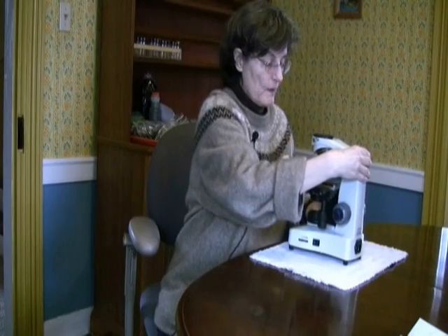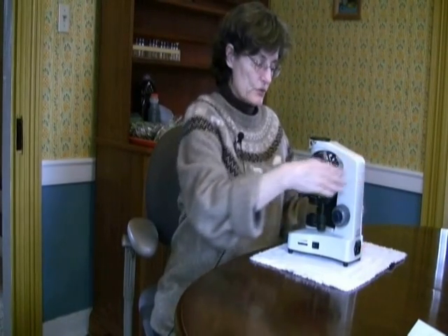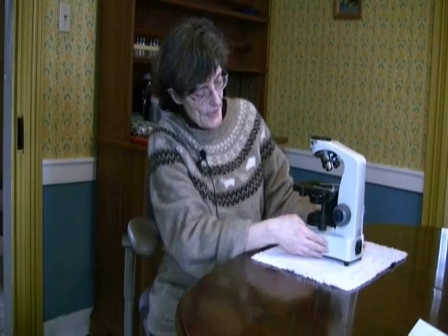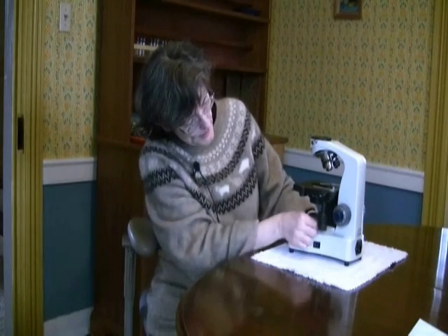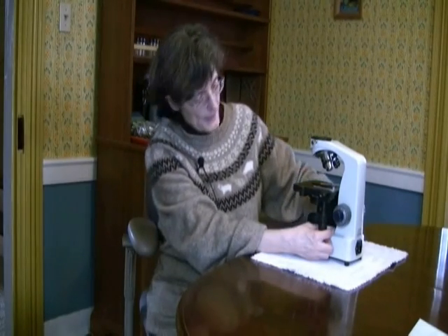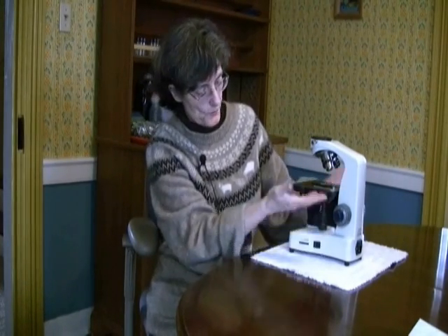that microscope. You typically want to have the microscope with the stage facing you, so you'll be able to manipulate things on the stage quite easily. We're looking at the lamp down in the bottom, so we should have an on-off switch and a brightness switch. When you first get your microscope, you may find a little piece of styrofoam under here. That's protecting your microscope from having that stage go up and down and bounce while it's in shipping.